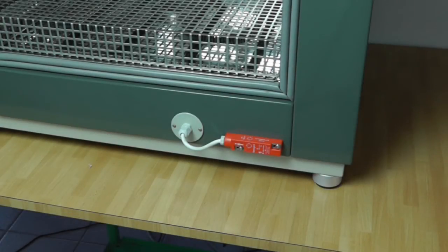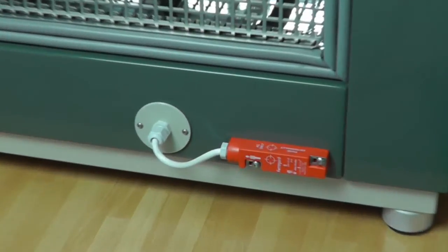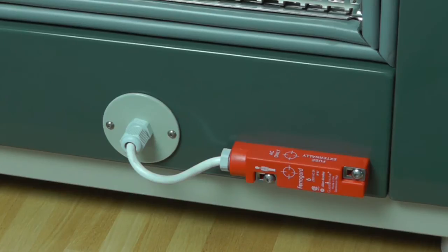Just a few words about the safety of the equipment. An overheating safety device cuts off the power supply in case of abnormal rise of the temperature inside the oven. Besides, the magnetic switch turns off the shelf when the door is opened.